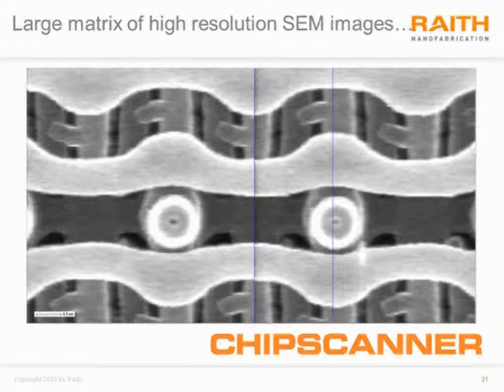The blue annotations are currently showing a 1 micron overlap, but this is far more overlap than what is necessary. We only show this overlap to show that stitching errors are far less than 1 micron. So by reducing these overlaps, speed can be improved for capturing these images over large areas.